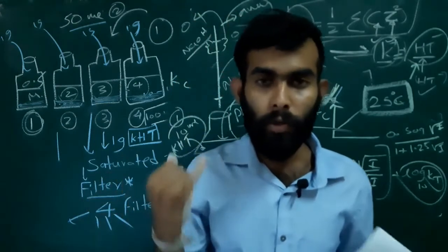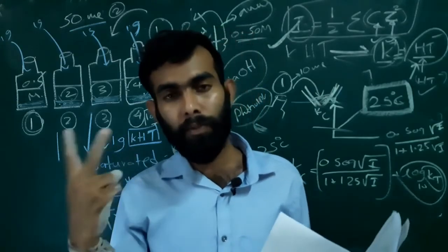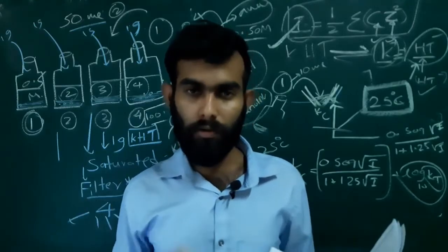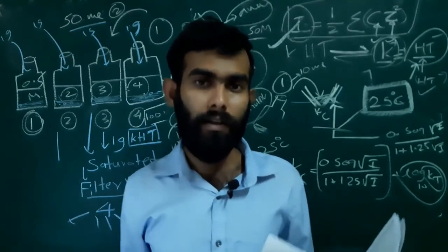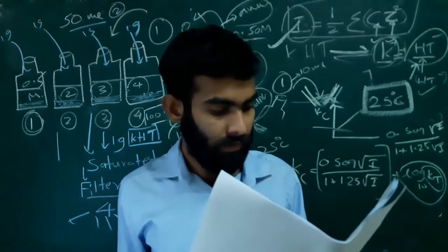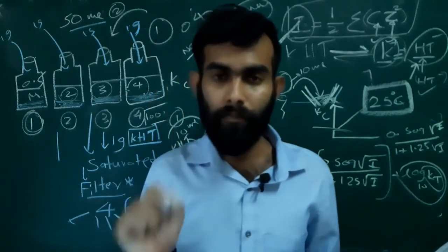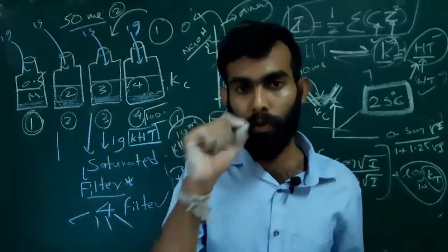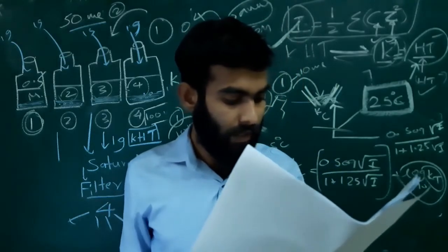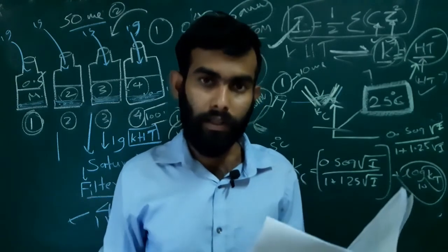First of all, you have to wash with tap water. Next, you have to rinse it with distilled water. If we are using a burette or pipette, we have to rinse it with the appropriate solution that we are going to measure from that measuring device. Okay. So here, if they mention 2 decimal points, like 0.00, we have to use a pipette or burette. And we are doing this experiment in a stoppered bottle.